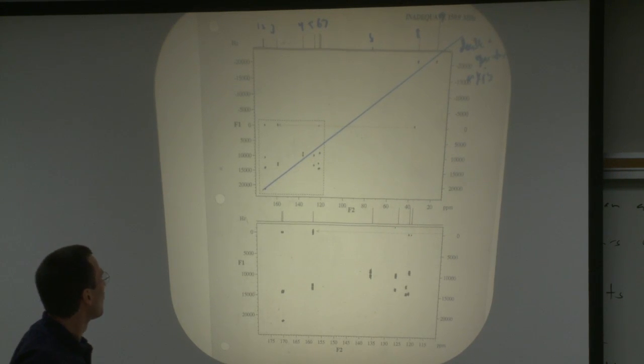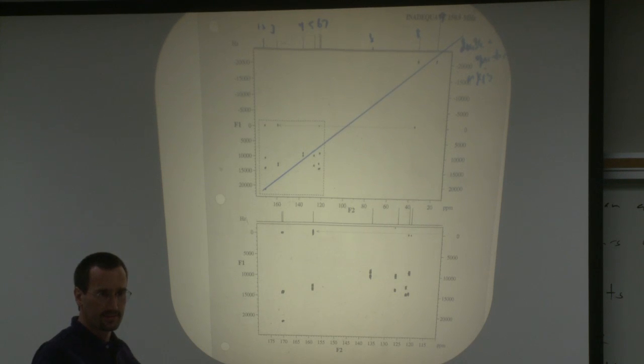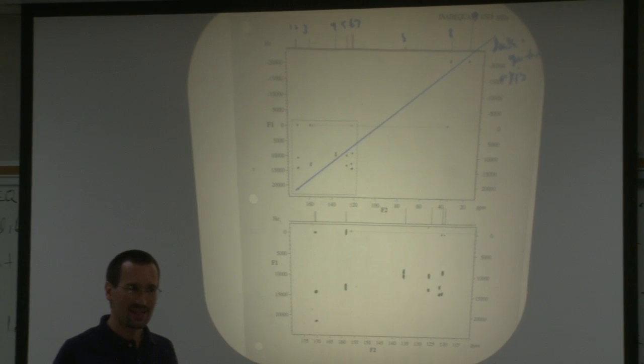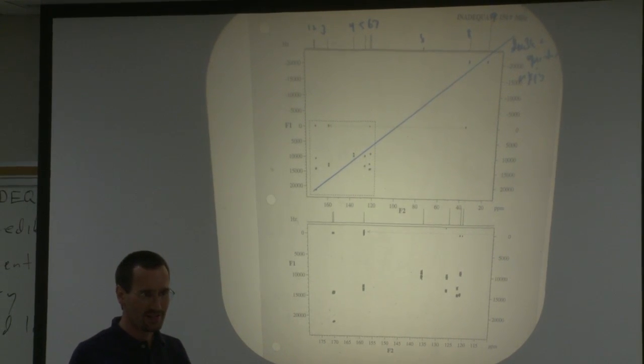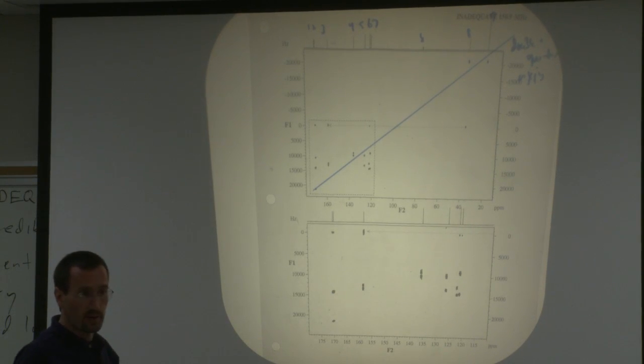9 is actually 2 carbons. It shows up as 2 methyls. It shows up as 1. Yeah, so that's what we were seeing with the 6 hydrogens. So what is that telling us about the 6 hydrogens? Probably not diastereotopic, probably some sort of isopropyl group in there.